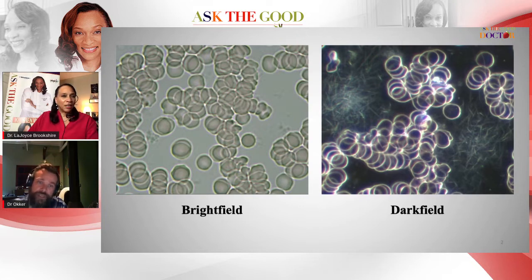Yes, absolutely. So this overlapping that we're seeing of the blood cells, that's called rouleau, and in most cases it's related to the digestive system. It's a sign of digestive imbalance. Usually, when we see that, we start looking in more detail at the client's history in terms of diet and lifestyle, what they're eating, and the symptoms they may be experiencing in digestion.